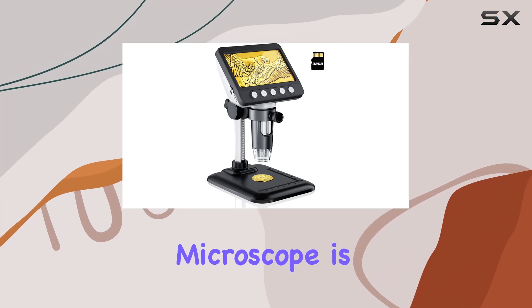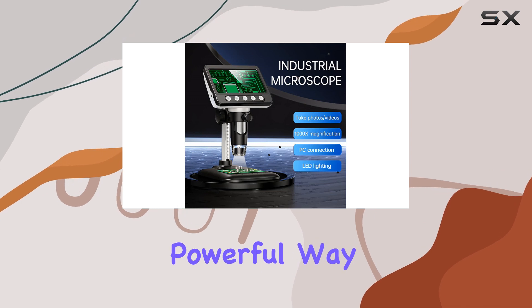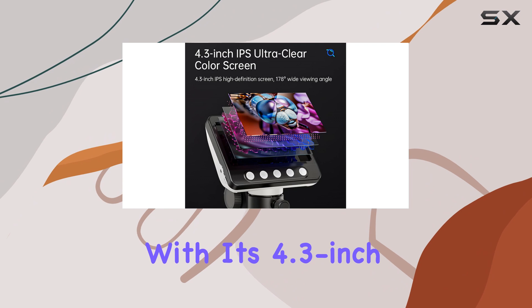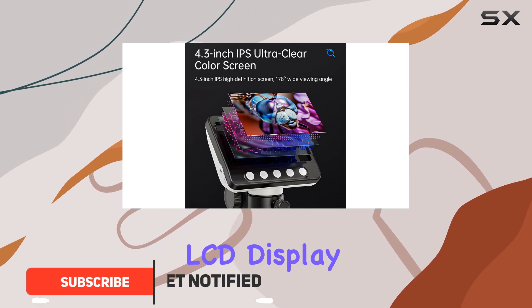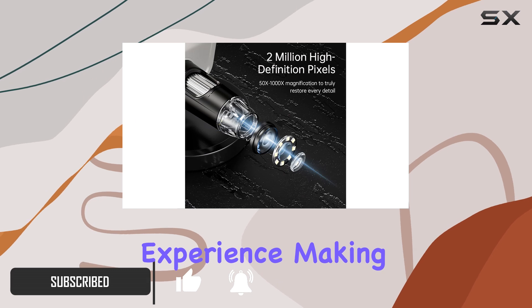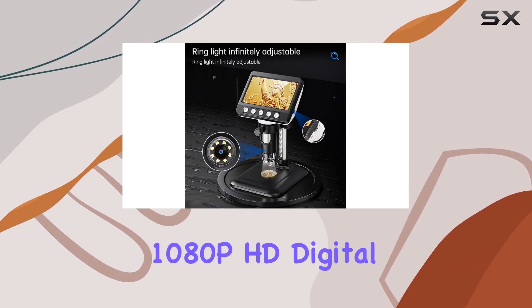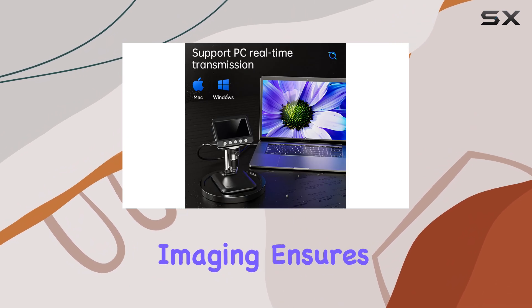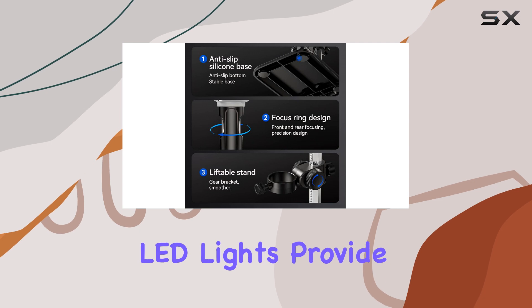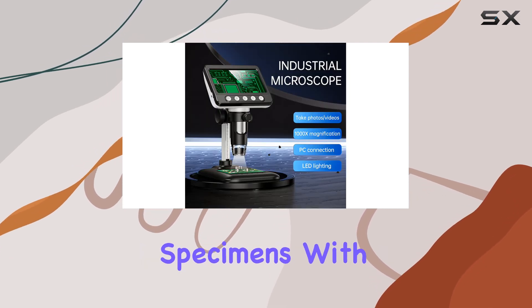The WKR Digital Microscope is an impressive device, offering a unique and powerful way to explore the world of micro-objects. With its 4.3-inch LCD display, you'll be treated to a crisp and clear viewing experience, making it easy to observe even the finest details. The 1080p HD digital imaging ensures a high-quality visual experience, and the eight adjustable LED lights provide ample illumination, allowing you to examine your specimens with precision.